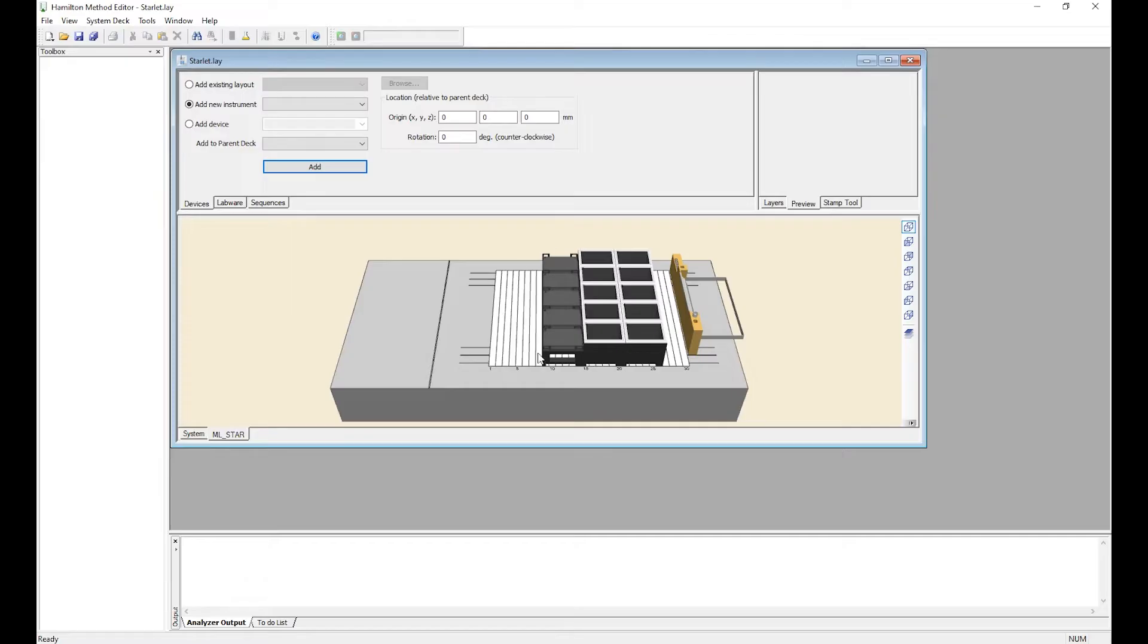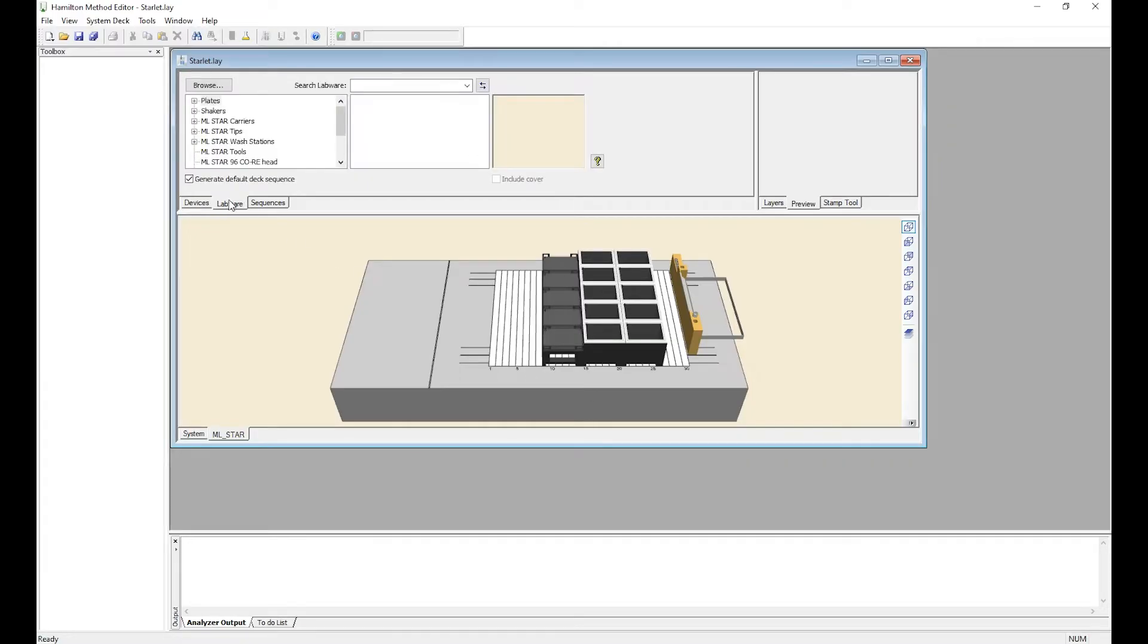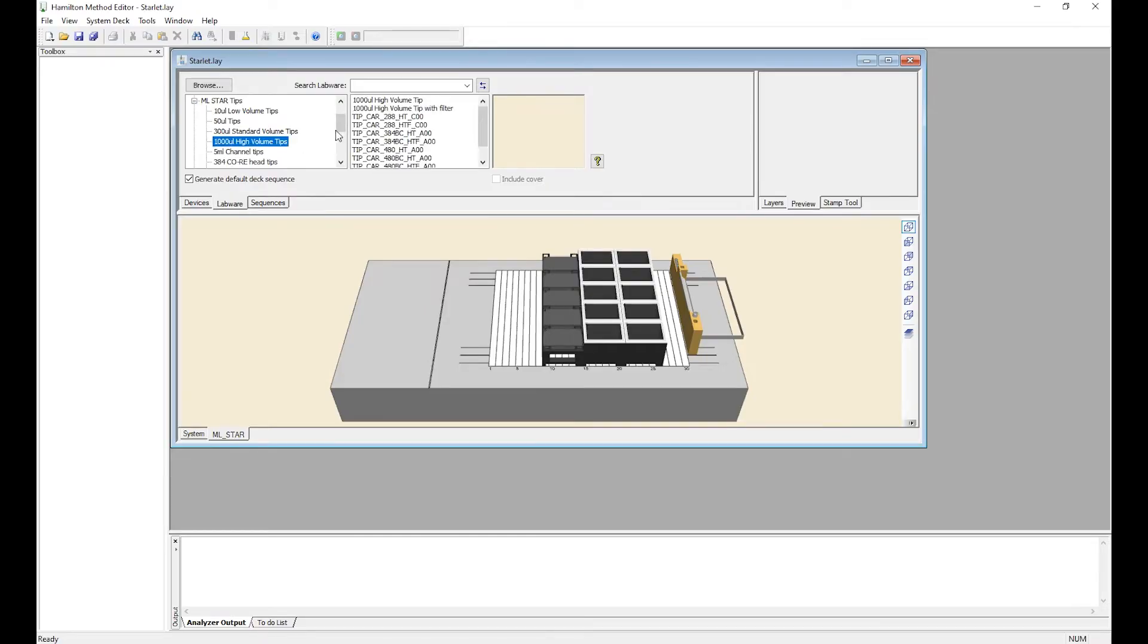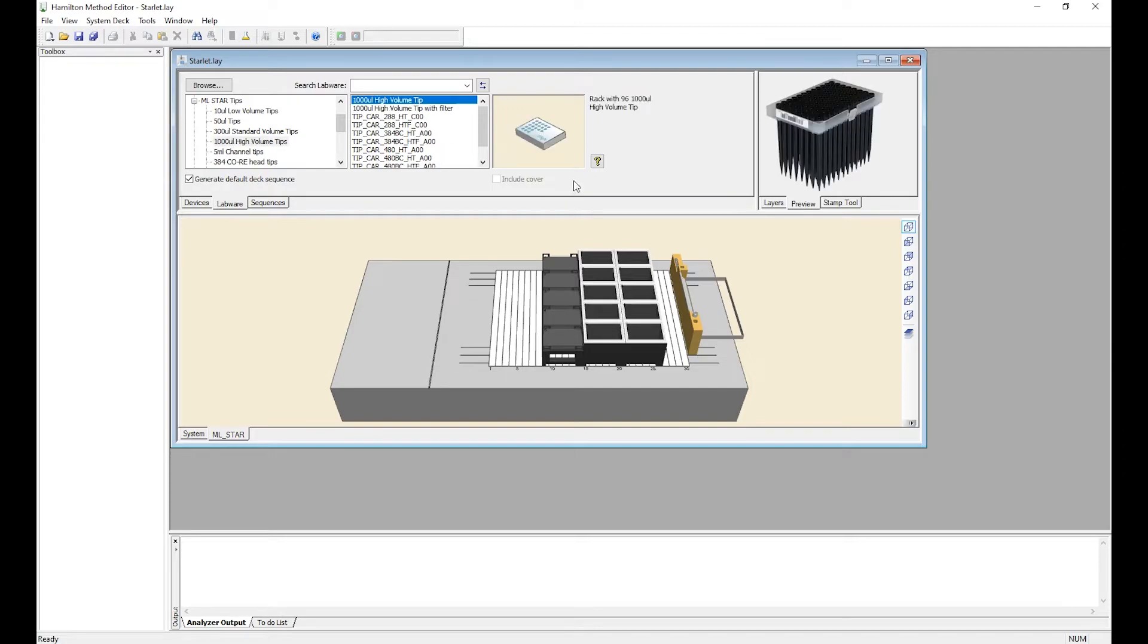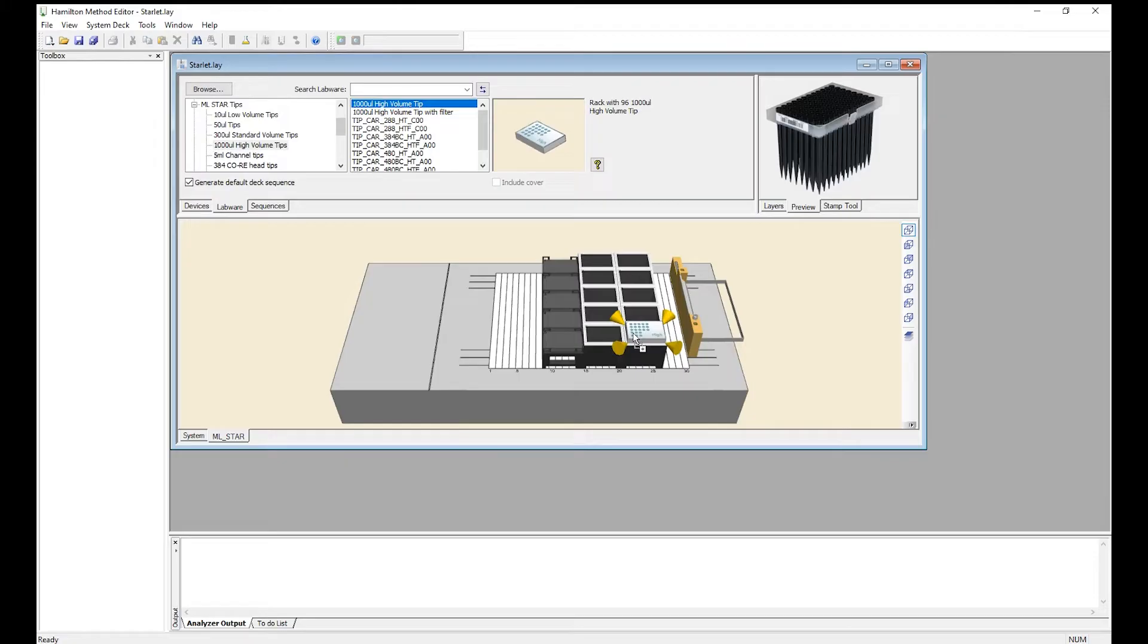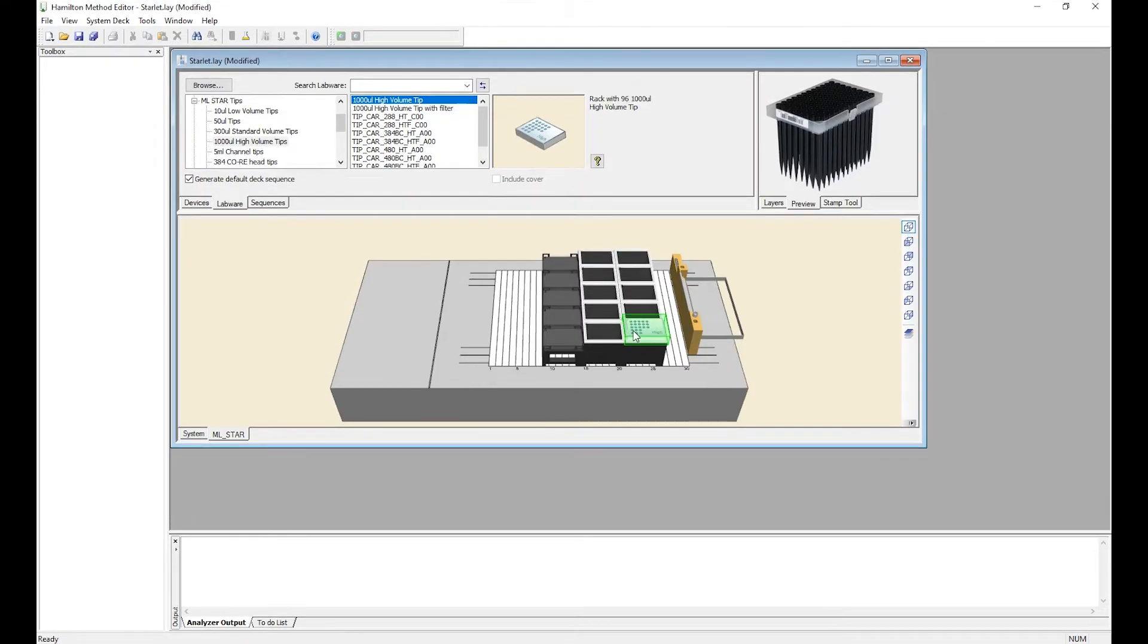Here we've already set up our deck positions and we're ready to create our method. First you'll need to load your deck with the labware needed. If you select labware, we're going to add tips. For today we're using the 1000 microliter high volume tips without filter. In order to put them on the deck you'll click here and drag it to the position where the existing tips are.